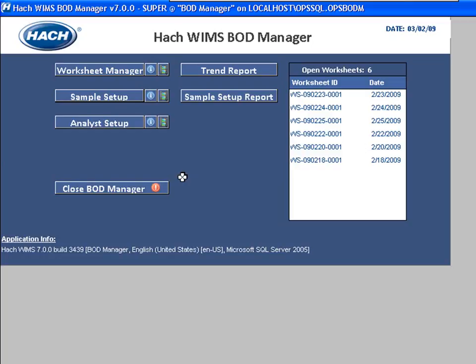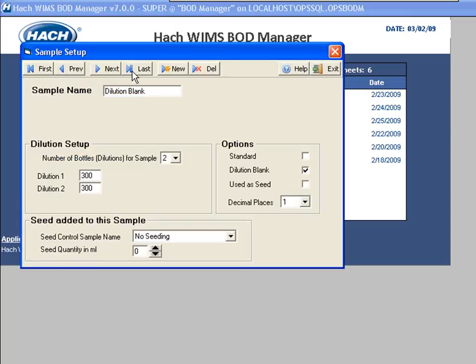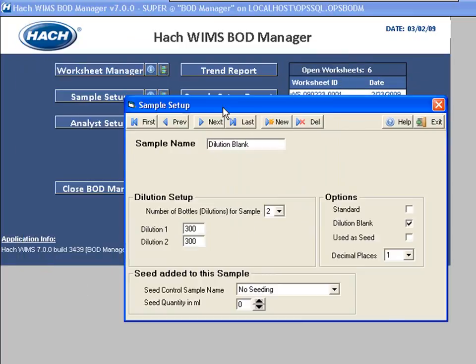Typically you're going to list your Influent, your Effluent, your dilution blanks, all that kind of stuff. I go ahead and click on the sample setup button right here and it's going to bring up the sample setup form that allows me to configure all of this.